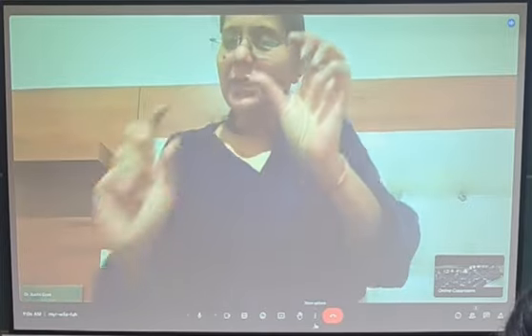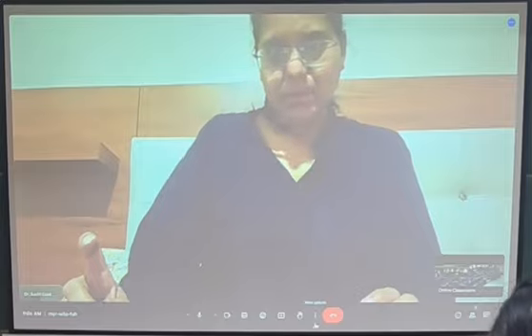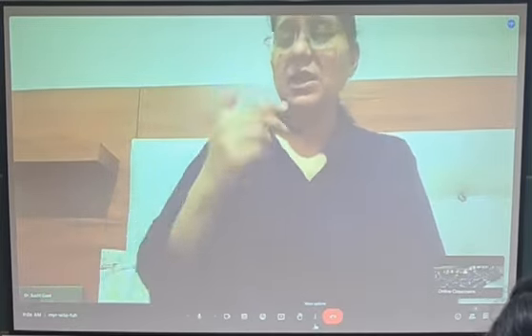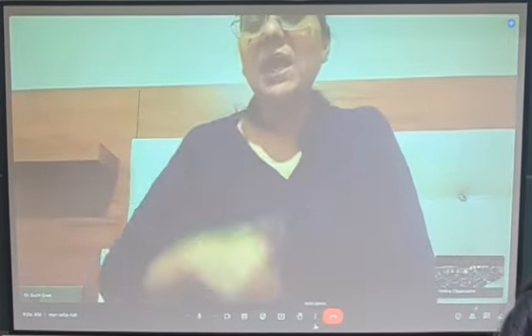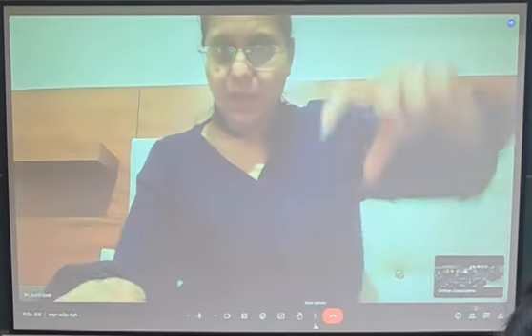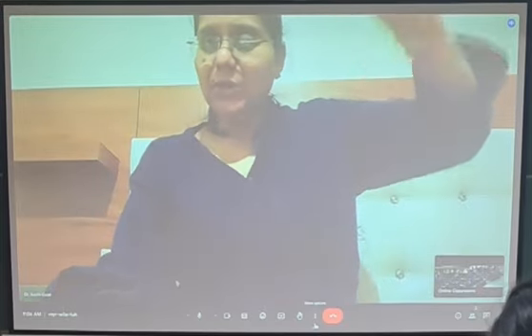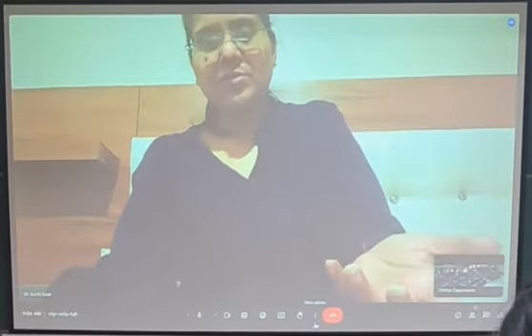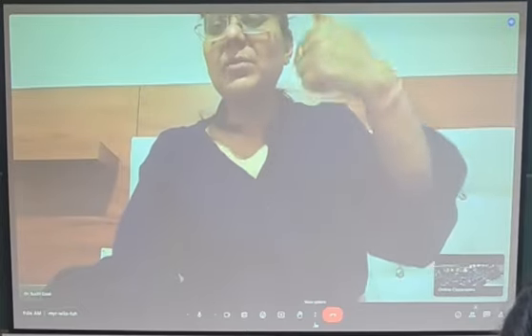So it means doing the turbidity experiment doesn't require incubation time, like the way you do it for getting a bacterial colony. If I ask you for the number of viable cells, then you will take the bacterial cells, plate them on the media, and incubate for 24 hours, and only then will you get CFU per ml. That means there is incubation time for me to know the growth of the bacteria. But to do a turbidity experiment, I need only 5 minutes. I need to take a sample and put it in the spectrophotometer. I will get a reading, 0.1, 0.2, 0.3, and that will also tell me my bacterial cells are growing.